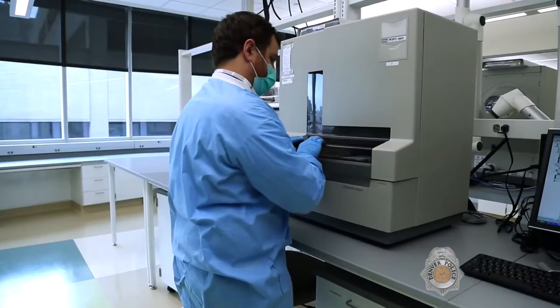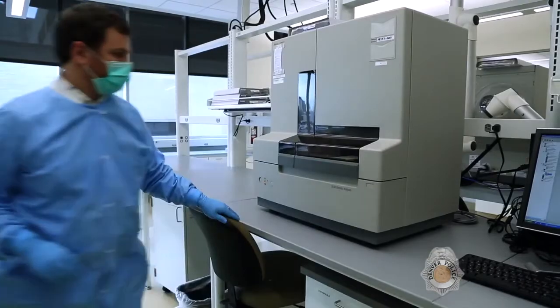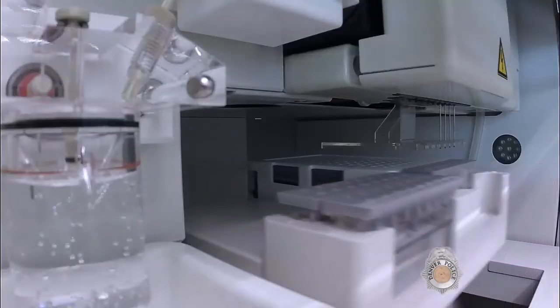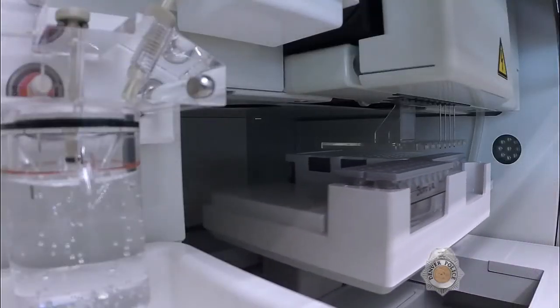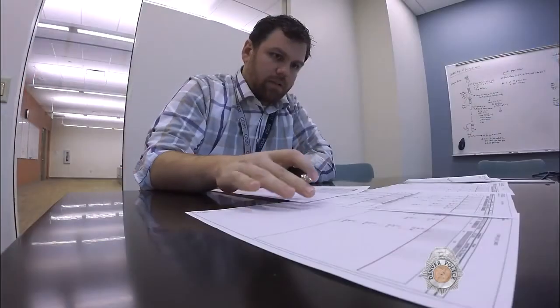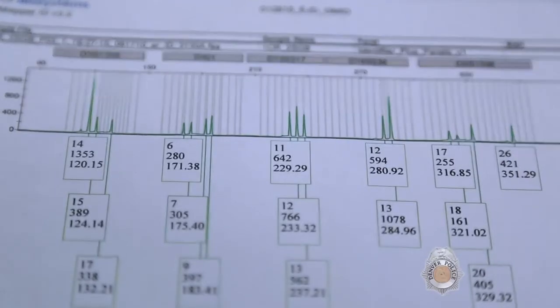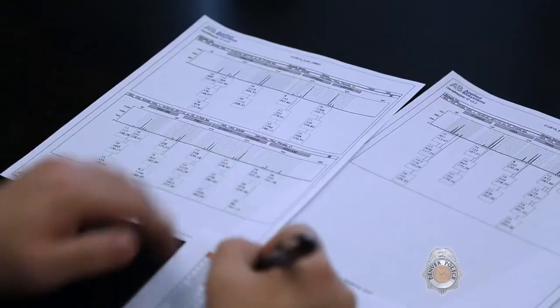Finally, the DNA is detected on an instrument called a genetic analyzer. This machine assembles the finished DNA profile, which analysts use to determine if biologic evidence from a crime scene matches the known DNA profile of a victim or suspect.